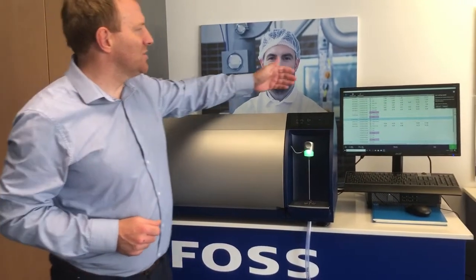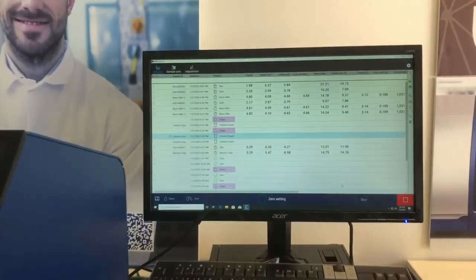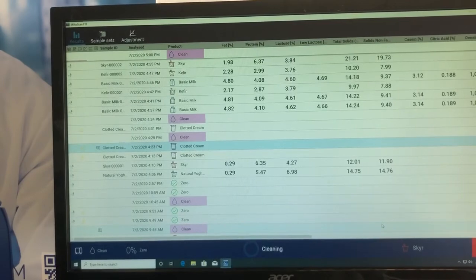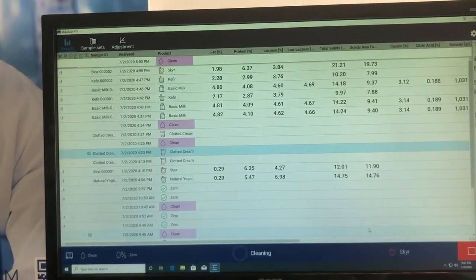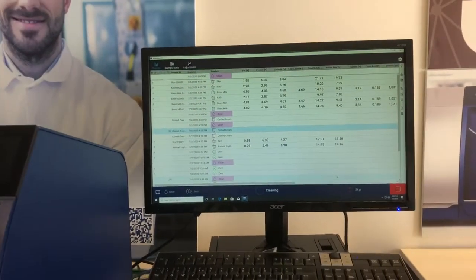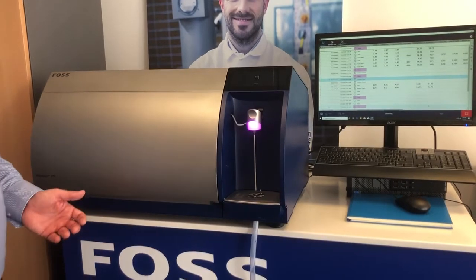The instrument is now running on the all-new Nova platform, giving a very clear layout and standardizing across the range of products. Some of our other instruments run on the same software. The instrument is also connectable to the internet.